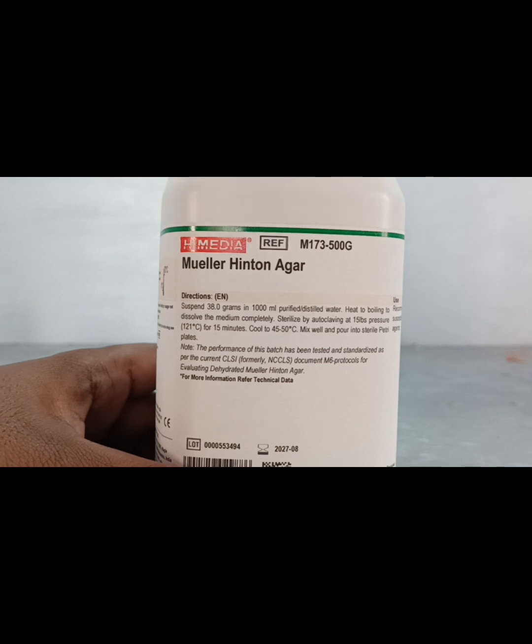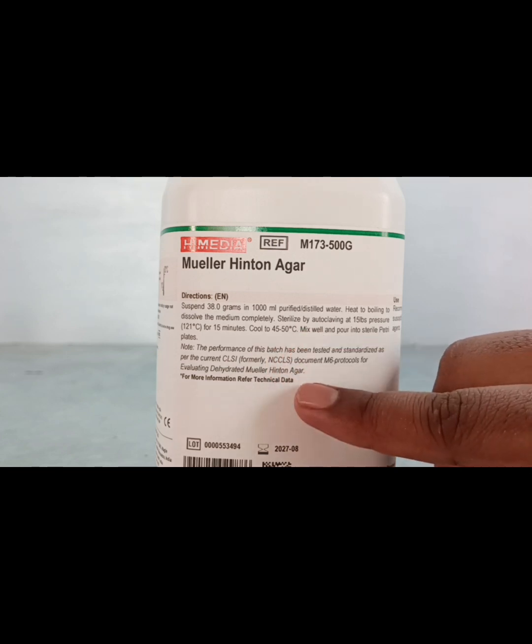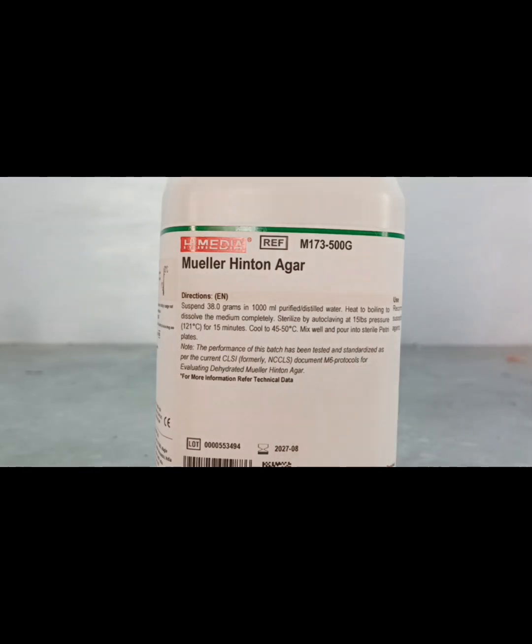As per calculation, 3.8 grams of agar powder must be dissolved in 100 ml of purified distilled water. We are taking 200 ml of sterile distilled water, so we need 7.6 grams. However, we are taking a few extra grams of Mueller Hinton agar powder, because at the time of measurement some agar powder attaches to the paper and is not easily removed properly.